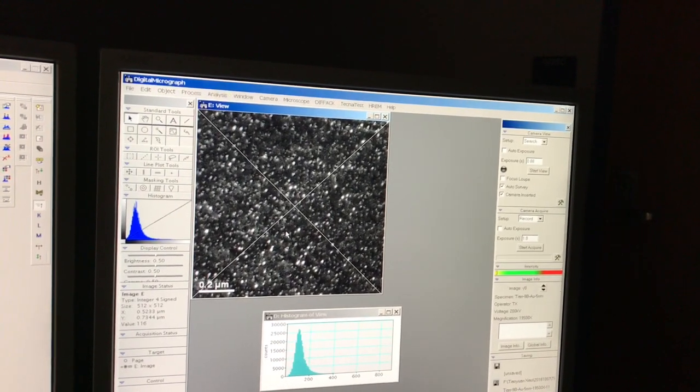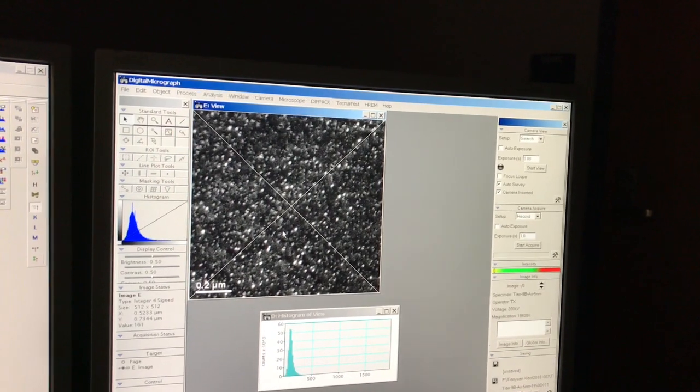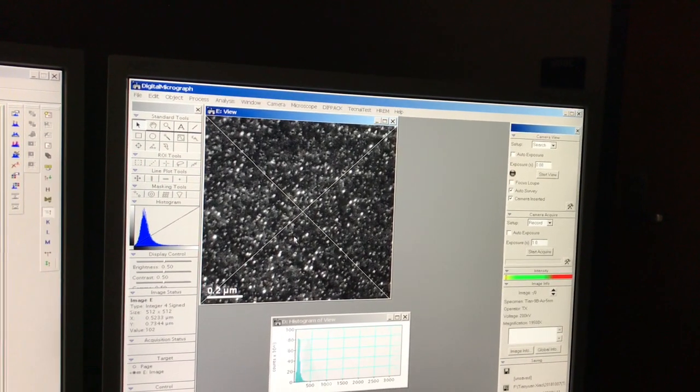That being said, the best way to provide the sharpest contrast is not with bright field or centered dark field. It's with what is known as weak beam dark field imaging, and that's what I'm going to show you how to set up next here.